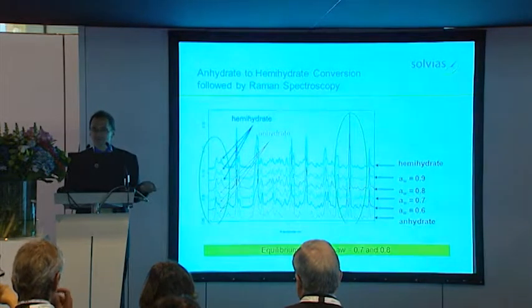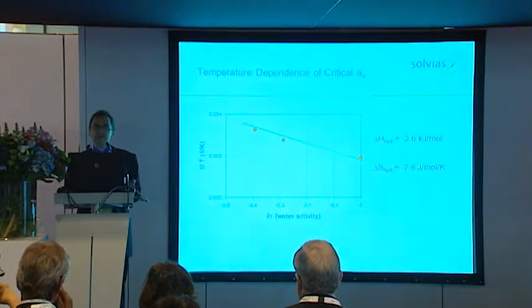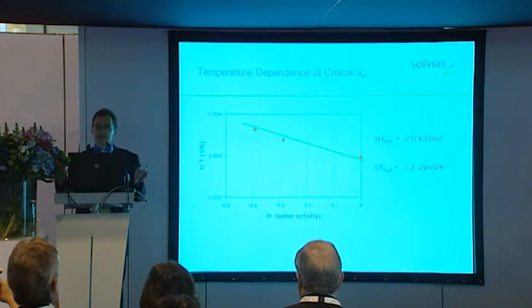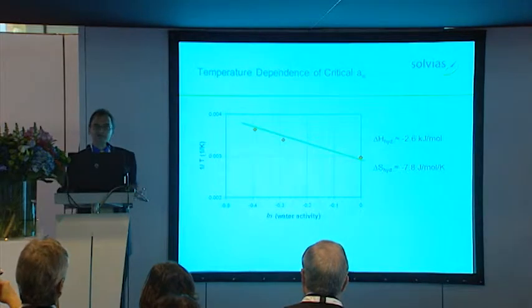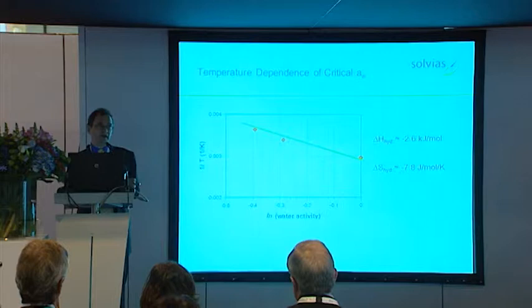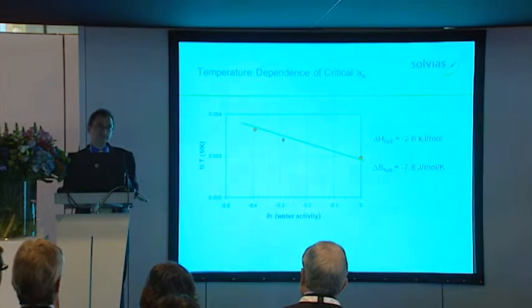You also have to determine that at various temperatures, as depicted here. And so by doing that in a high throughput way, we get the phase diagram and can then determine crystallization parameters. In this particular case, we helped the customer who produced mixtures of hydrate, anhydrate and hemihydrate, and we then told them how to change the conditions to get the desired form, which was the anhydrate, consistently.